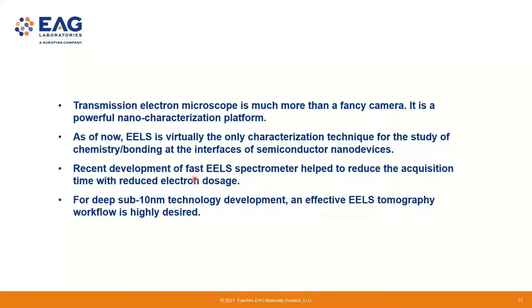Of course, the recent development of the fast EELS spectrometer helped to reduce acquisition time with reduced electron dosage. And for deep sub-10 nanometer technology development, we probably want to think about really an effective EELS tomography workflow, right? As I just mentioned, EELS tomography has been published for a while, but we really need to think about how to collect the data quickly, how to process data quickly, and how to present the very complicated four-dimensional data set to a non-expert, like a process engineer, right? So this is probably more relevant to the industry, right?